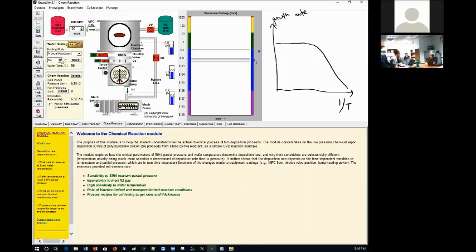So switch to 100 degrees. Of course, the proper way of doing this would be to write down the numbers too, right? So you would like to write down these numbers on a piece of paper or in your notebook. But don't worry now because I have it written for you, okay? Just to speed things up, you don't have to worry about that part. We will just use those text files that I sent you.